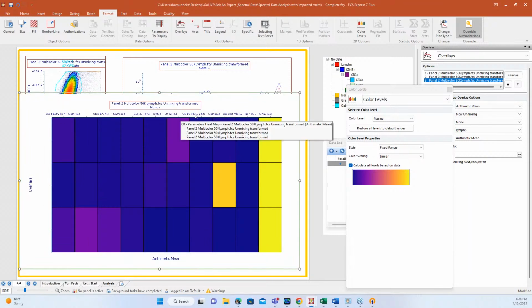And if you see the names here, like some of our parameters, because we have so many and they're a bit longer, they will take up space for the next parameter. So if you make it big enough, you can change this. You can also change the angle so that the names show better. But yeah, you have a lot of flexibility.